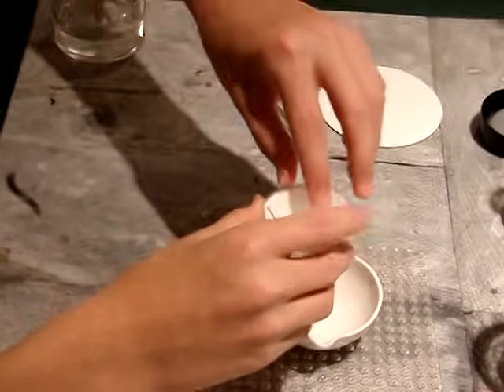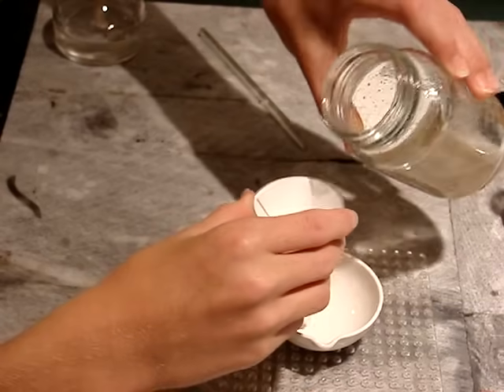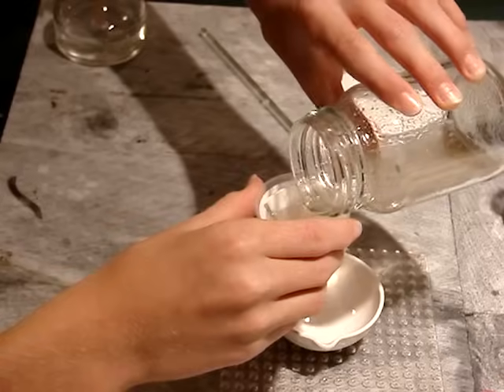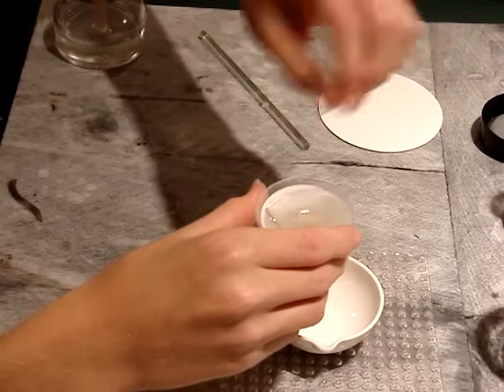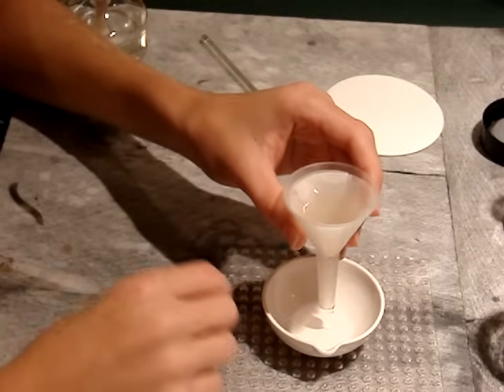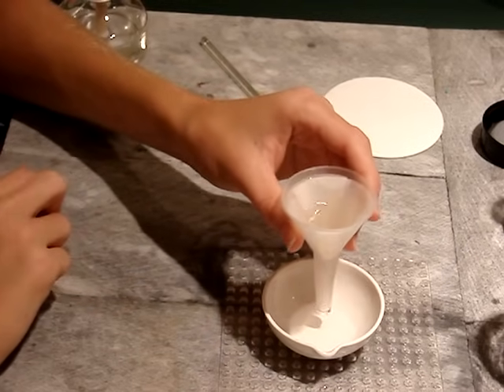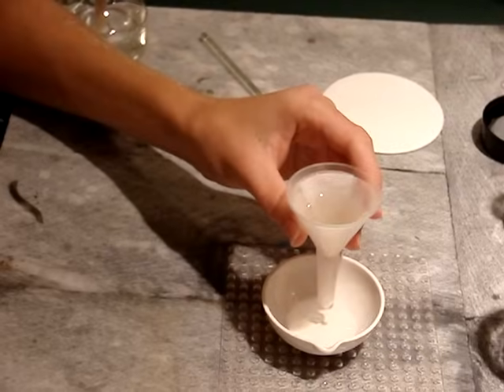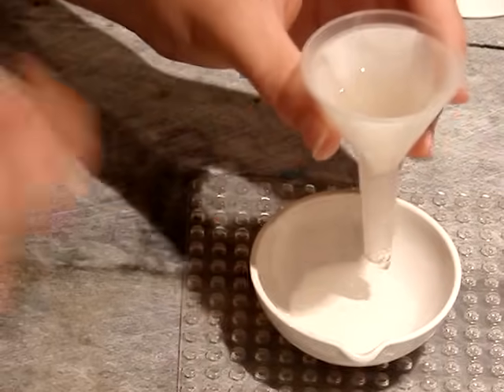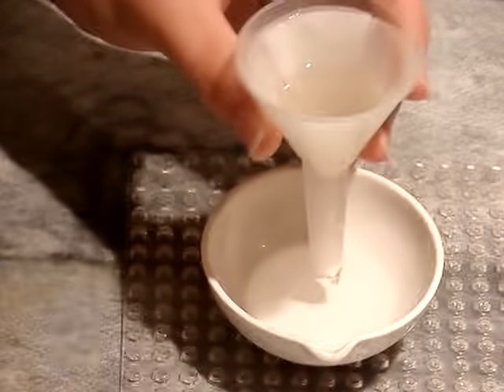and I'm just going to pour some of my concoction into here. Not too much. And let it filter out. It's fast in the beginning, but it gets very slow. I'm not going to filter out all of it because that would take way too long. I'm just going to take a small sampling of seawater, salt water here, and there will only be a little bit of sand left in the jar. I mean, in the filter.